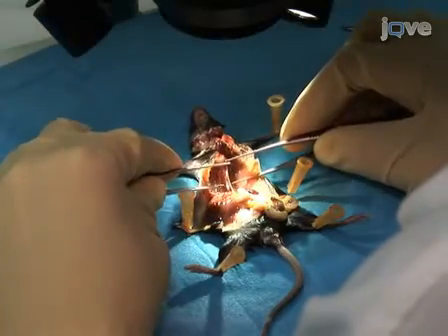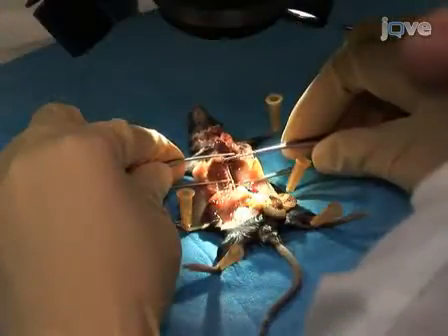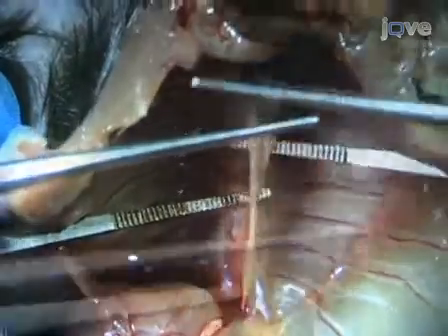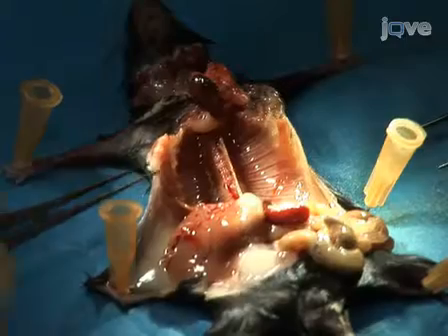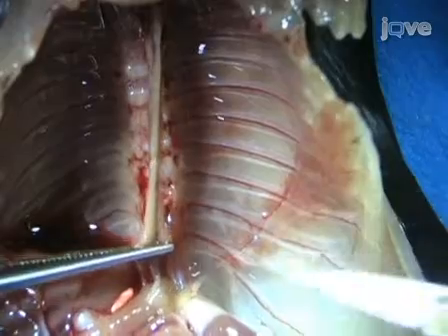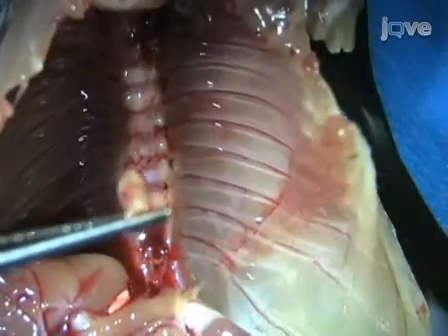With the aorta exposed, insert thin, sterile tweezers between the aorta and the spine, spread the tweezers open, and gradually lift the aorta from its bed, separating the thoracic segment from the rest of the aorta. Now that the aorta is separated, use sharp scissors to cut it away from the mouse, starting on the end which is in close proximity to the renal vessels, and ending near the heart.